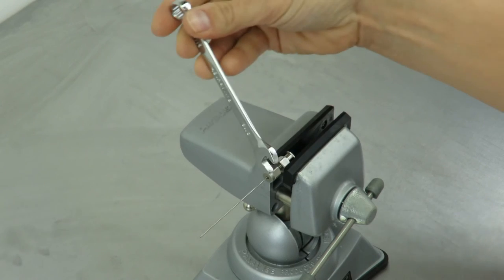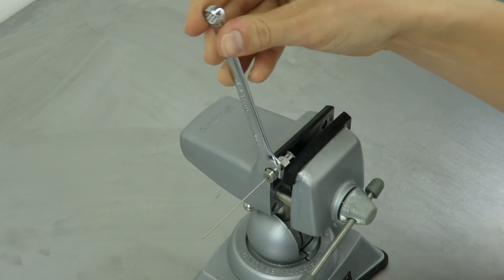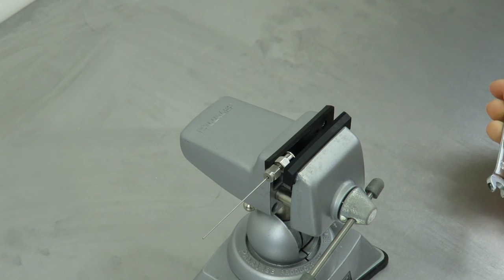Then, using the correct open end wrench, fully tighten the nut. And now you have a custom 20 gauge needle.